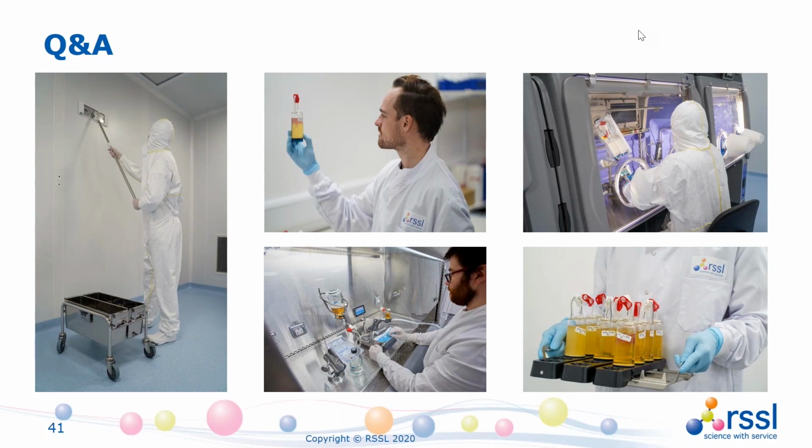My experience is that what most people do is focus on the viral security of their products and the viral inactivation steps that they have in place to get rid of any viruses in the product, and then will perform marker testing for the presence of any viruses of concern. So I think you can introduce that at the initial steps, but then another complication is that there aren't that many laboratories attached to manufacturers that have the capability to handle viruses, so it might be something you need to hand out to a specialist laboratory. But a lot of it you will be led by the nature of the manufacturer and the type of viruses you're keen to eliminate.